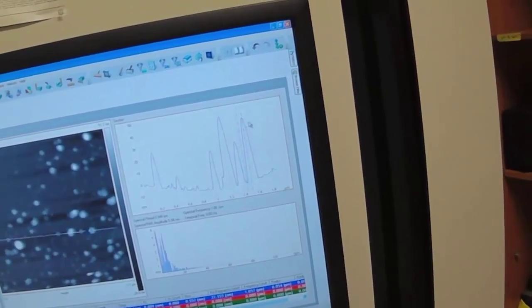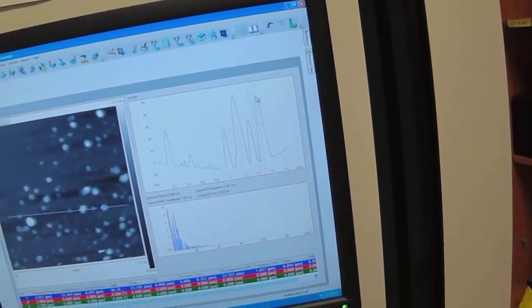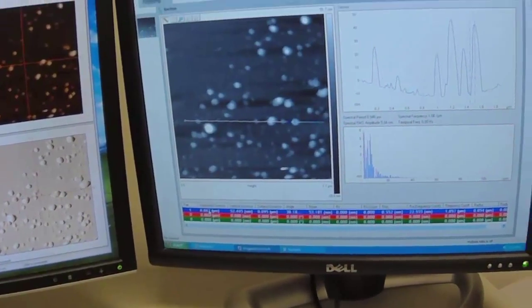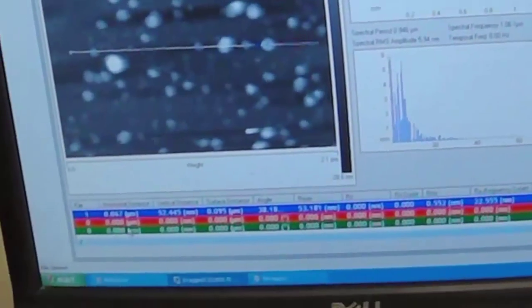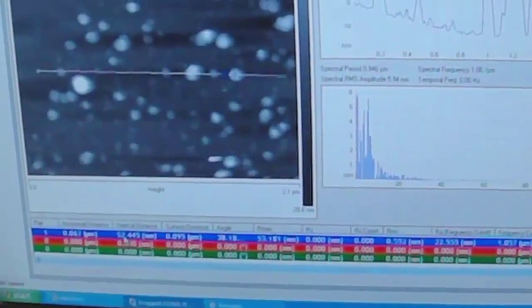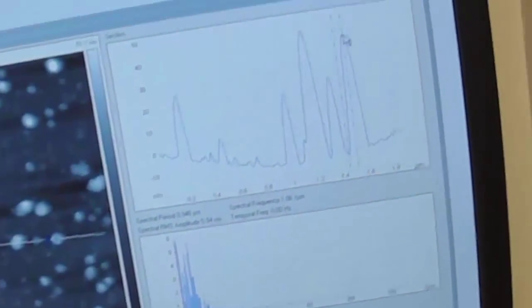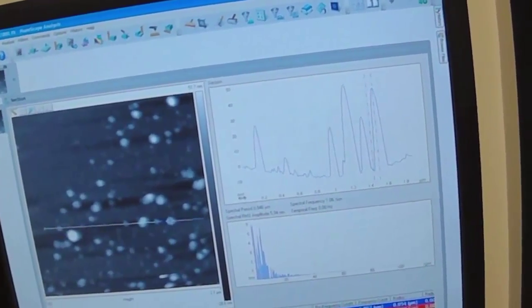So the difference in height from this cursor to this cursor is the height of the peak. And that's what here in the blue, this is our blue line, blue cross section. Between those two vertical lines here, they are 0.067 microns apart. So this distance is 0.067 microns. The vertical distance, so that's the height, is 52 nanometers. So from here to here is 52 nanometers. So that's telling me the height of the peak, which should be the diameter of the particle.